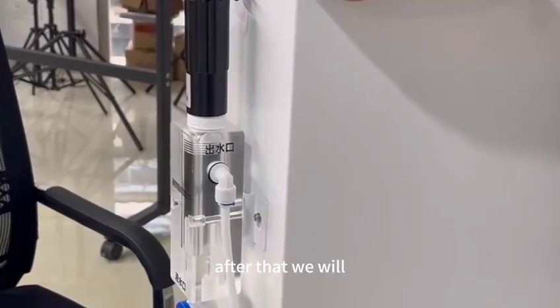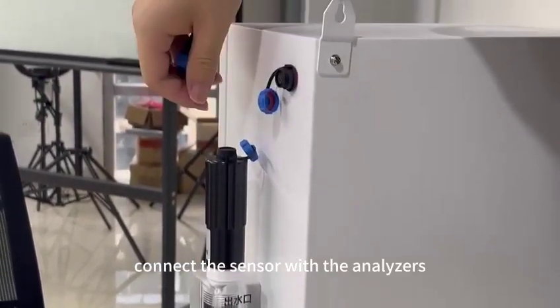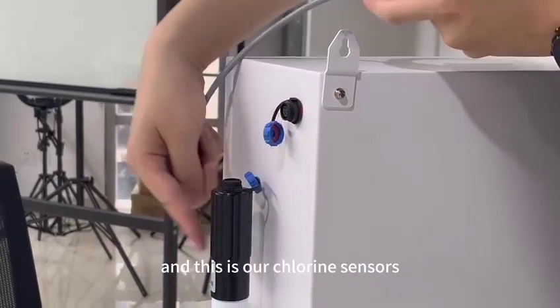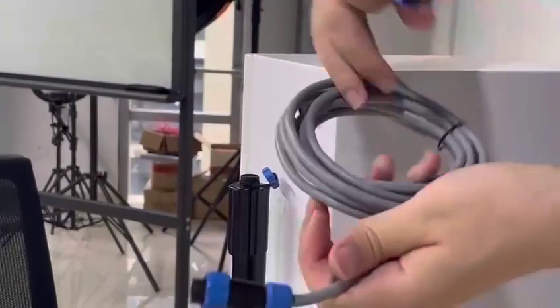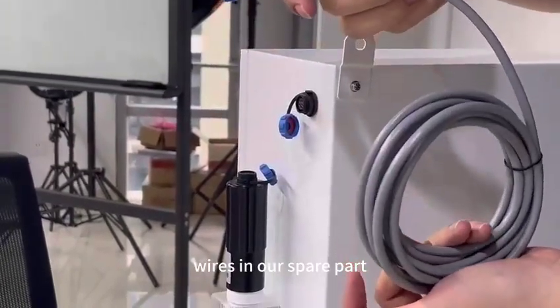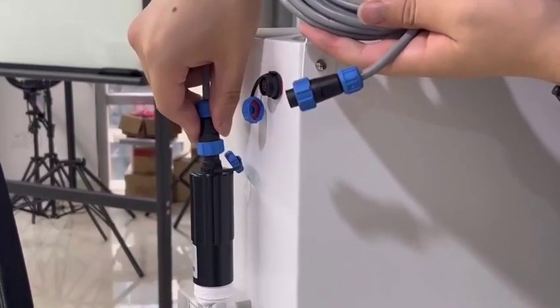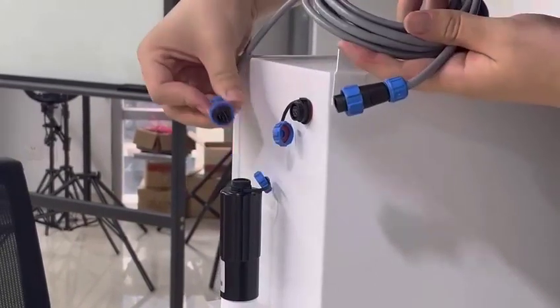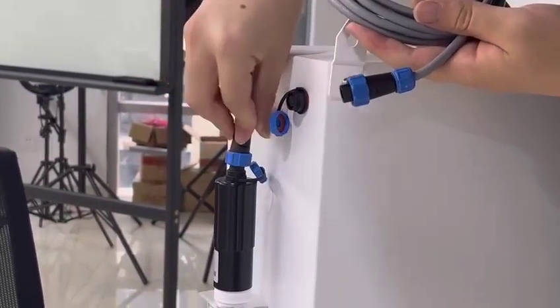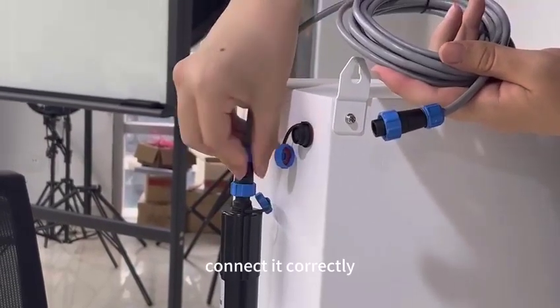After that, we will connect the sensor with the analyzer. This is our chlorine sensor. We use the cable from our spare part pack, and then just make sure you connect it correctly.